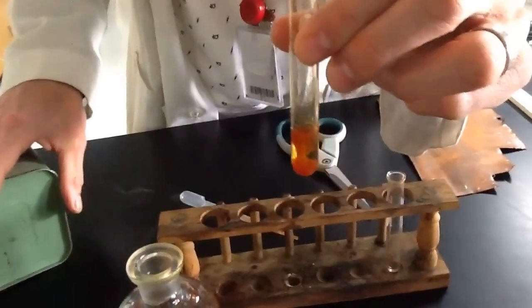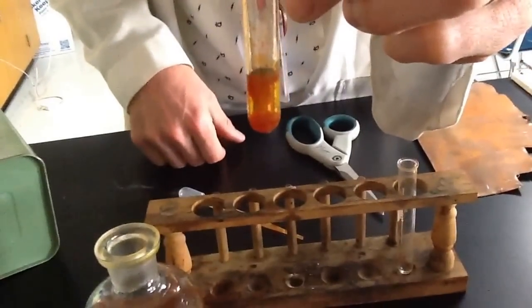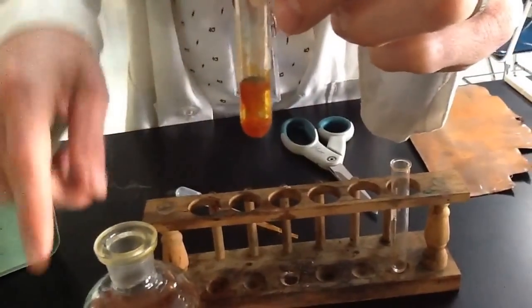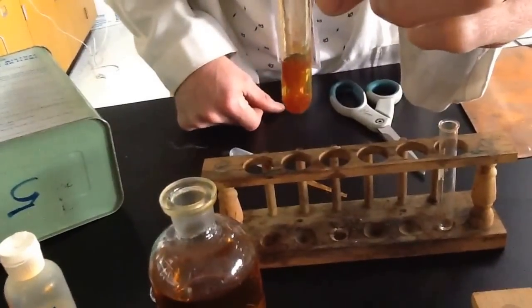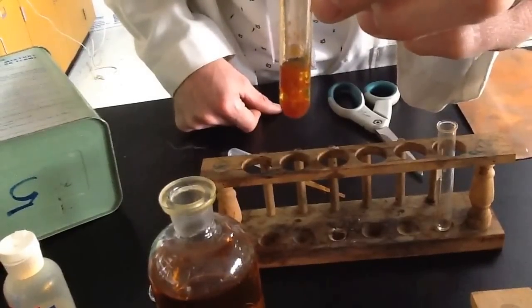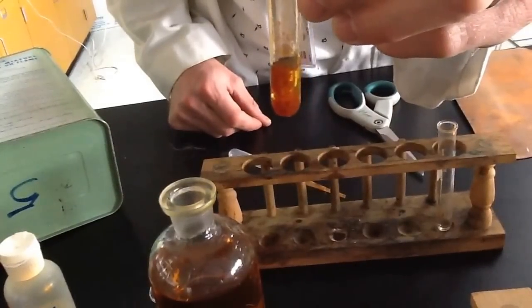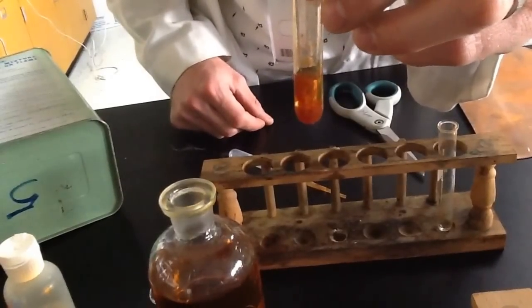And for those of you that remember from first semester, you could check your solubility chart and figure out which solid that is. And it turns out it is the iron ion from this bottle with the hydroxide from the other bottle. Those two make a solid precipitate when they meet up inside that solution. So that's your reddish brown solid. And then you can take this out if you wanted to and put it in a centrifuge and spin it around and actually decant your liquid, leaving you this solid. So that is a double replacement reaction.